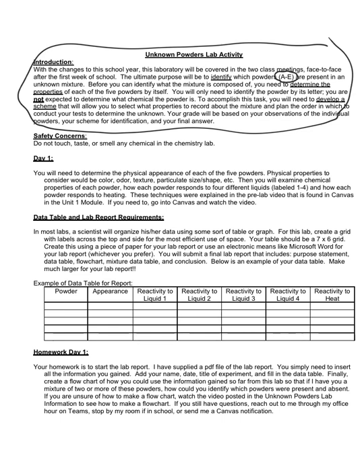Now, before you can identify a mixture, you have to first know the physical and chemical properties of each of the individual powders, and that is the purpose of day 1. Day 1 is for you to build up a multitude of chemical and physical properties that you know are unique to each of the powders themselves.